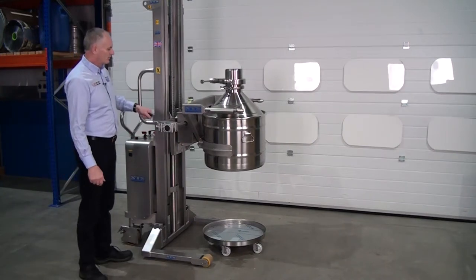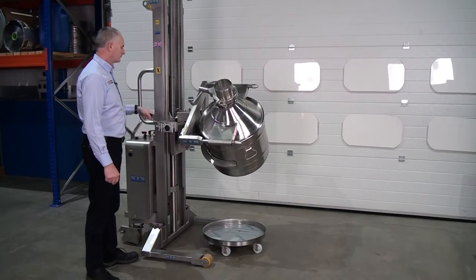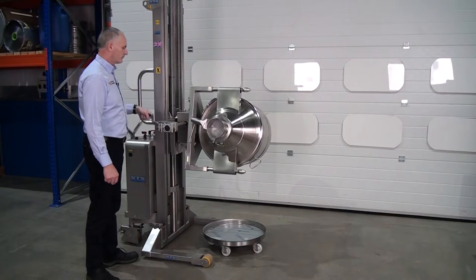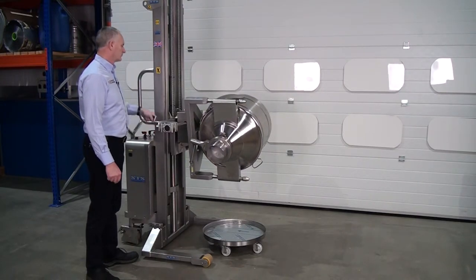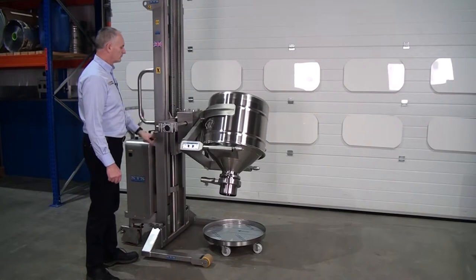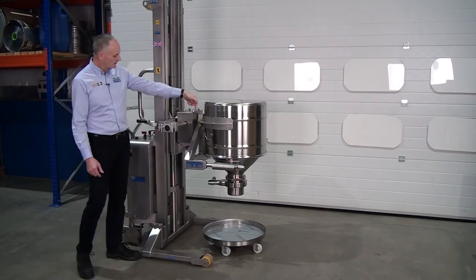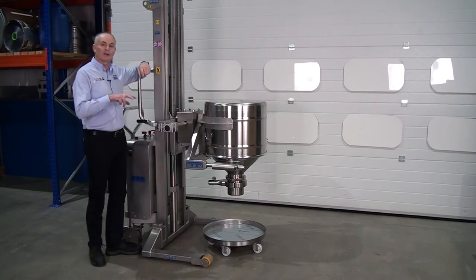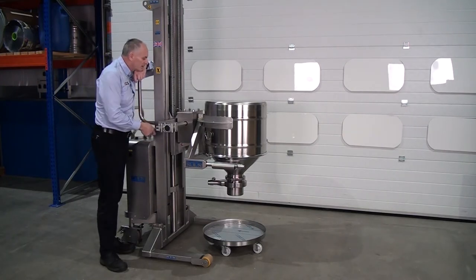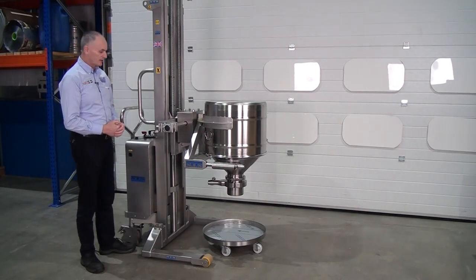Rotation handle here — so literally just rotate the handle around. There's a level bubble positioned here, so when we're going up to actually pick it back up, we just turn that until we see the bubble in the middle. As soon as the bubble's aligned, we know that we're perfectly level to do the docking of the unit.